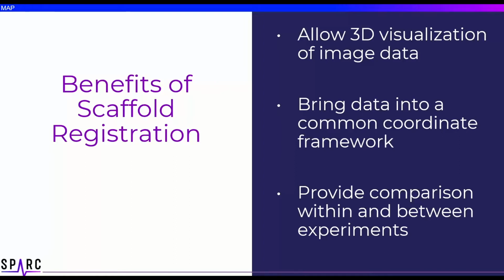This is a very powerful tool as we now have the ability to piece data from seemingly unrelated studies together onto a single model. This allows for the interrogation of possible interaction between different experimental findings and also helps drive further research by identifying gaps in our current knowledge.